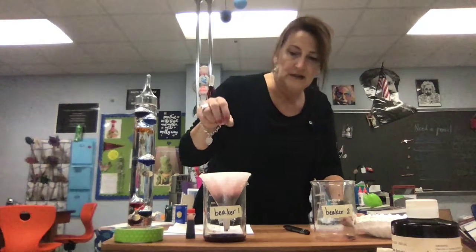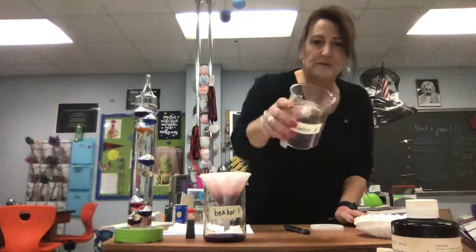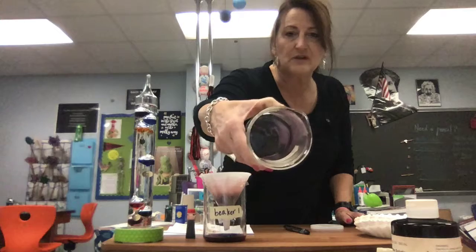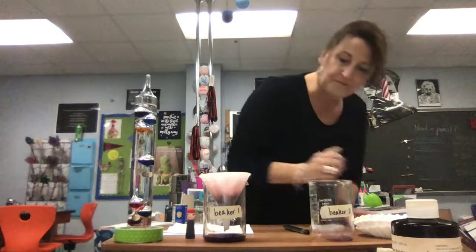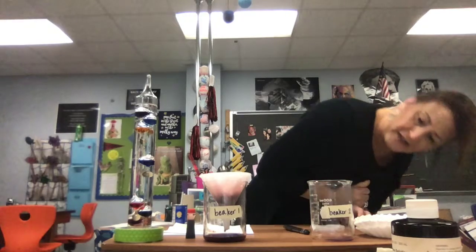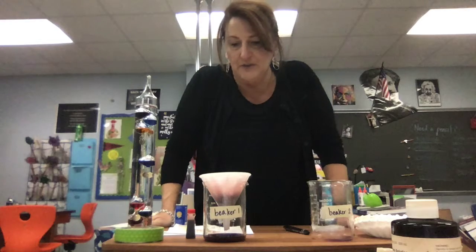Okay. And then, you can see the purple a little bit better now because there's some cornstarch left over. So you can see that it's really purple. Okay. So I need to wait for all of this to drain, and it's got a little bit more to go.